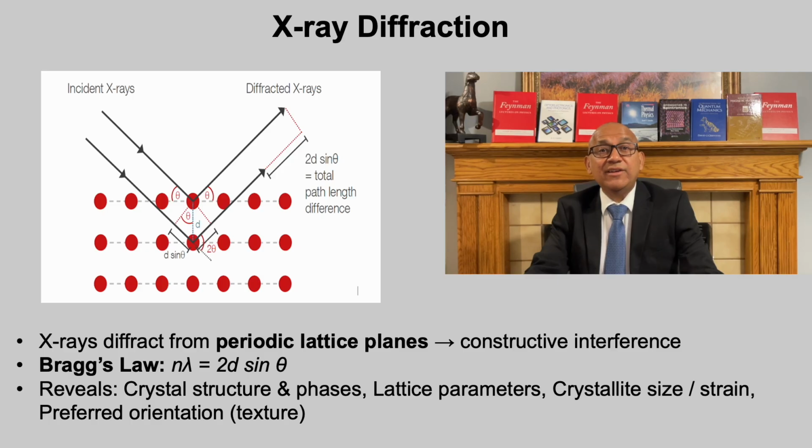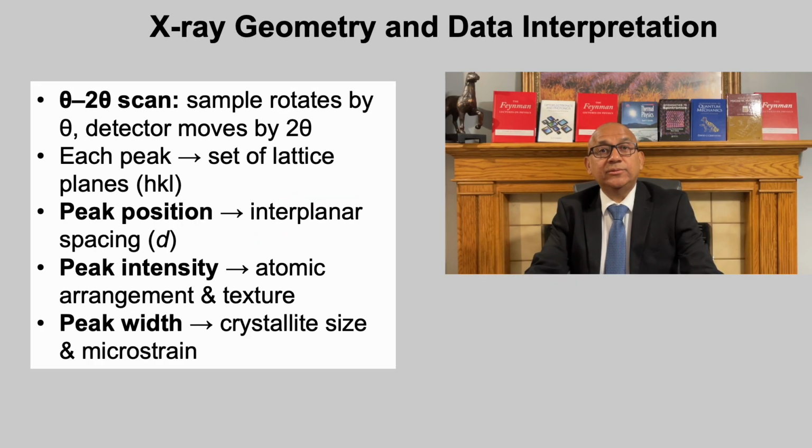Because the X-ray wavelength is about 1 angstrom, it is comparable to interatomic spacings. XRD bridges atomic scale periodicity and microscopic measurements. It is non-destructive, highly reproducible, and forms the foundation for almost every subsequent technique in structural analysis.